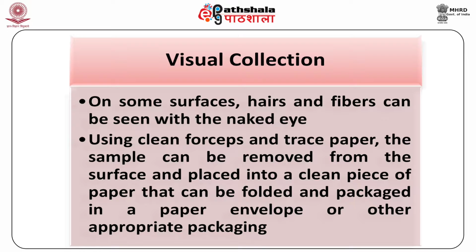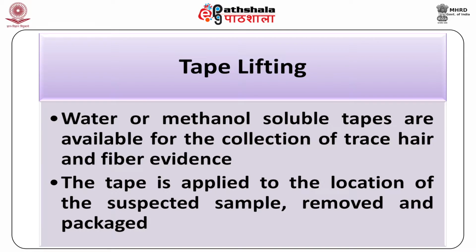Using clean forceps and trace paper, the sample can be removed from the surface and placed into a clean piece of paper that can be folded and packaged in a paper envelope or other appropriate packaging. Tape lifting is another method.